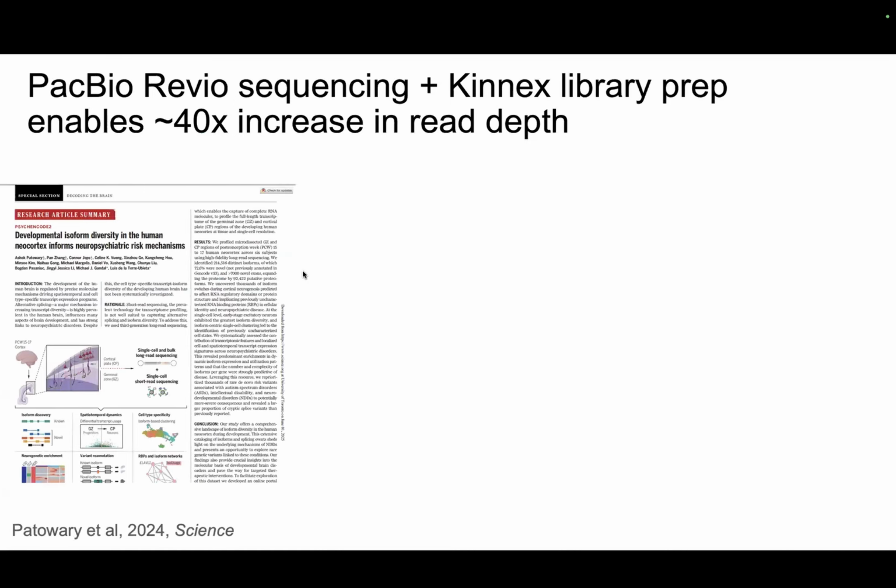As I mentioned earlier, in this project we're using Kinnex, the latest PacBio chemistry kit for long-read RNA-seq data. Here on the left, I have a screenshot of this paper from Patawari et al. They have a very similar experimental design to ours, but they're using tissue from fetal developing brains. We love this paper. Our study is very much inspired by it.